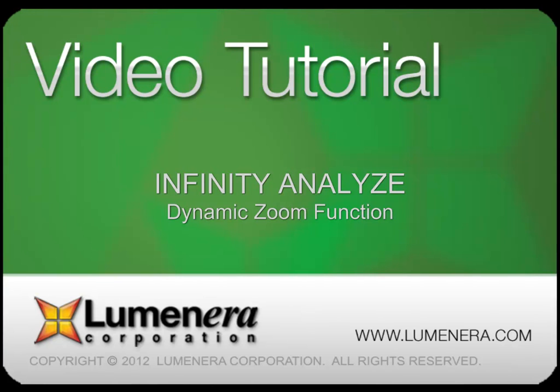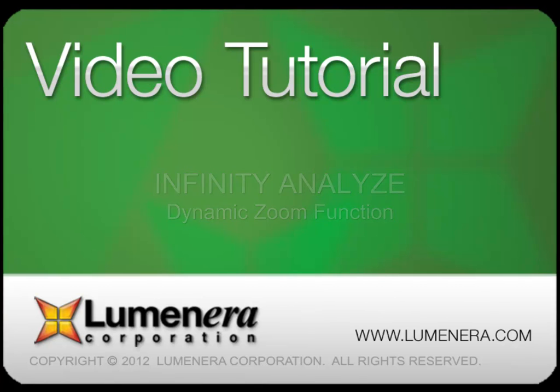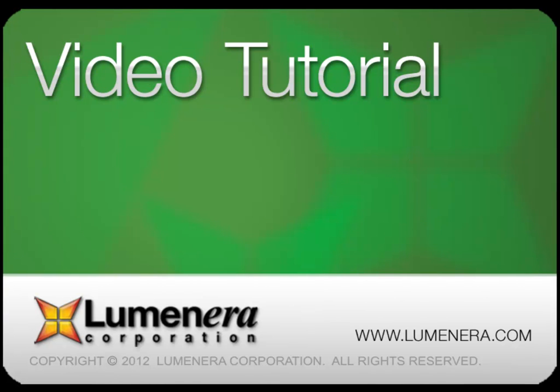This is another tutorial in our series on the Infinity Analyze Microscopy Package. In this session, we look at the dynamic zoom function added to Infinity Analyze with the release of version 6.0.0.